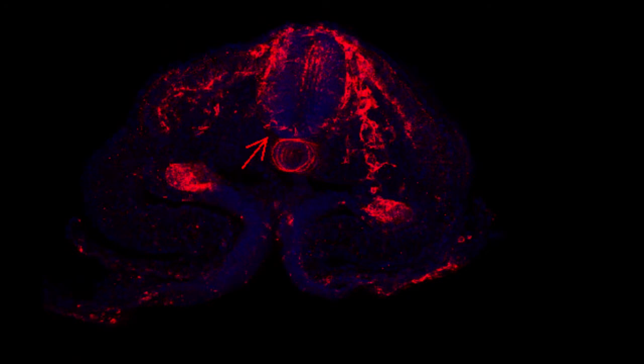The red is neural crest cells immunofluorescently labeled with a red fluorophore. Such thick vibratome sections can be scanned along the z-axis without interference from out of focus light only with a confocal microscope.